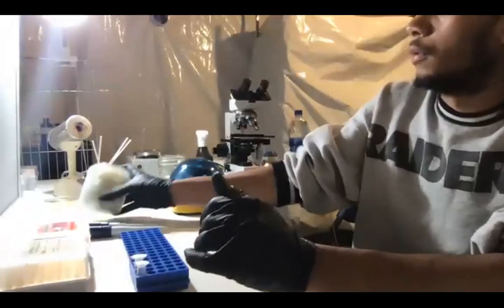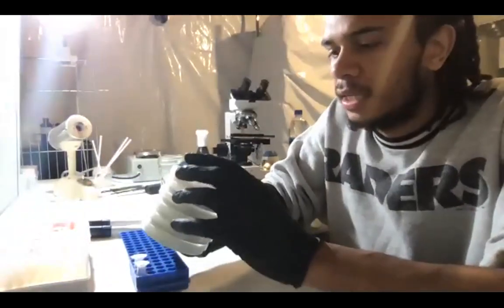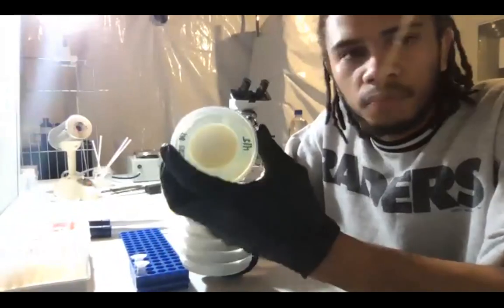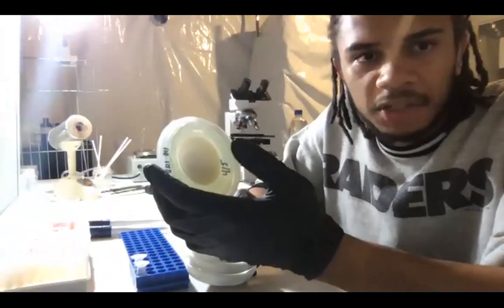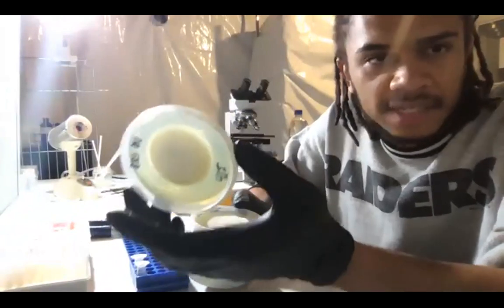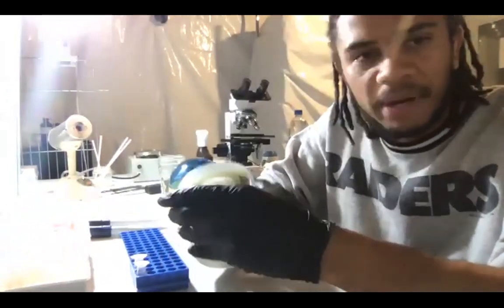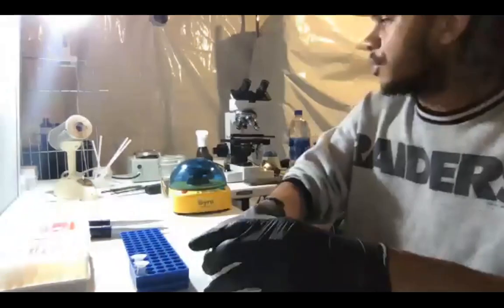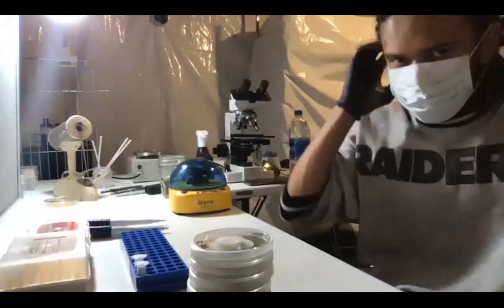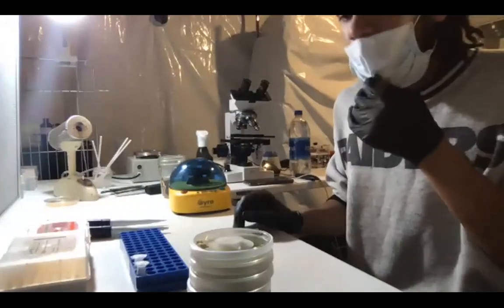All right, so today what we're going to be doing is mating type ID, which requires PCR, because there's no real way to look at a fungus microscopically or macroscopically and tell what sex it is, basically. So basically what we're doing is we're sexing our parent strains that we're going to be using to breed with. I'll put this mask on to make sure that I'm not breathing anything onto my clean work here.